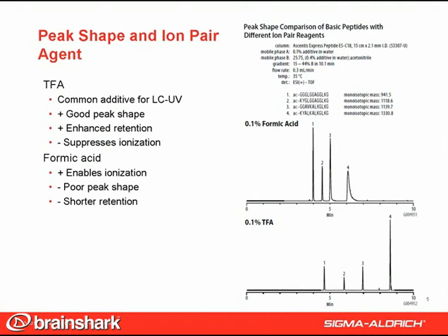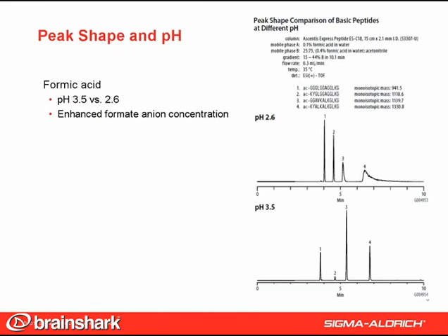Also note the enhanced retention of peptides in the presence of TFA, presumably due to the greater hydrophobicity of TFA relative to formic acid. This figure shows both peak shape and retention benefits of TFA. However, one can overcome the deficiencies of formic acid by leveraging the mobile phase pH, as this slide shows. If we adjust the pH of the mobile phase from 2.6 to 3.5, a dramatic improvement in peak shape can be seen. The improved peak shape at pH 3.5 is best explained as a result of the increase in formate ion concentration.